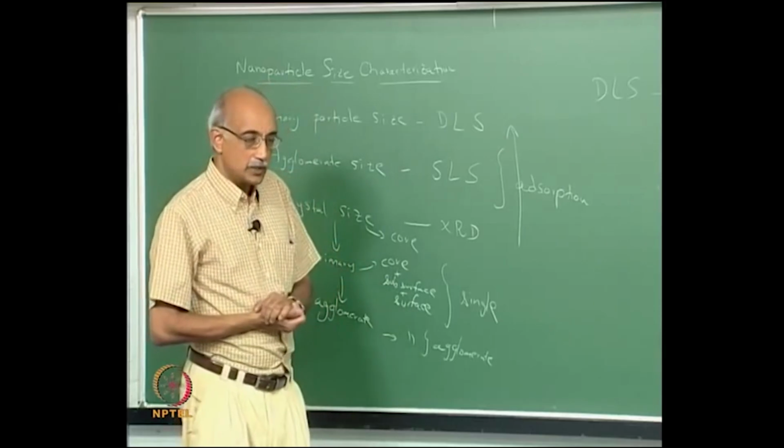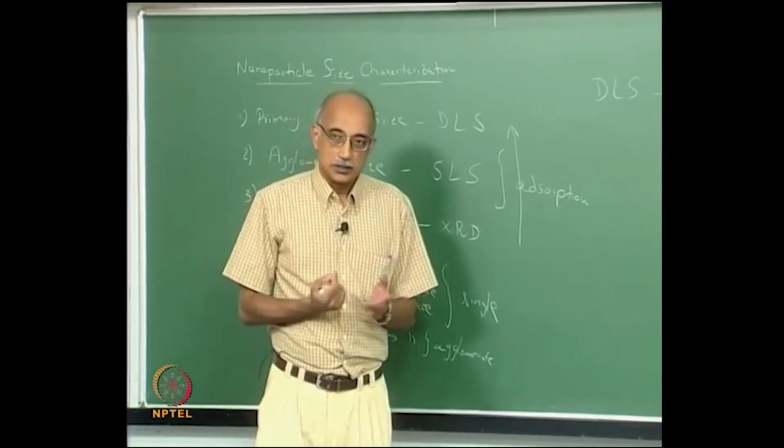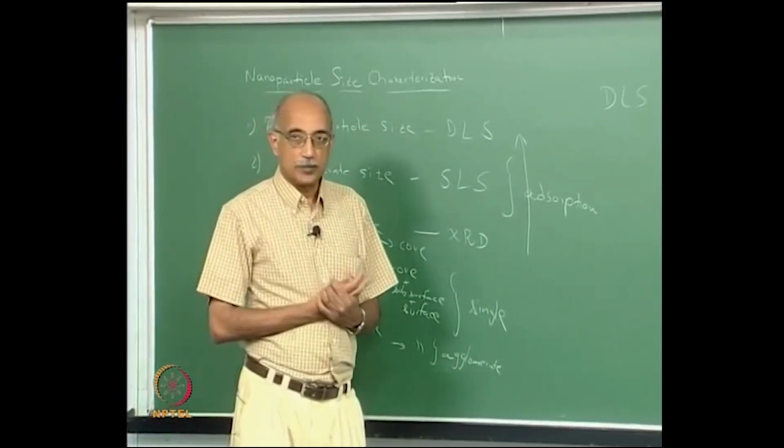So, all of these diameters are relevant in different applications, and which of these you choose to measure really depends on what you are trying to accomplish with your measurements.